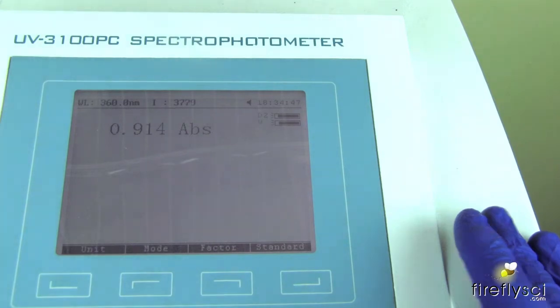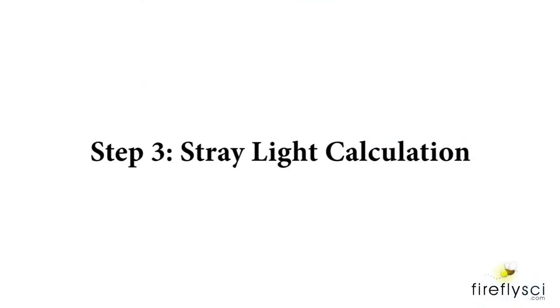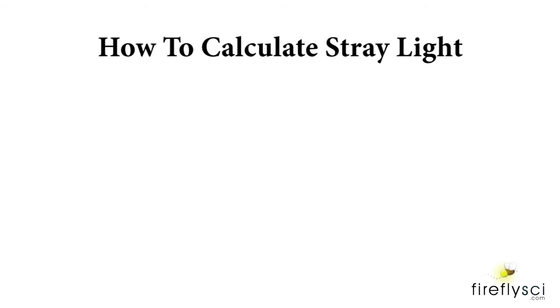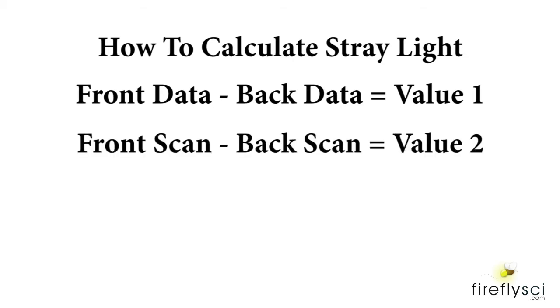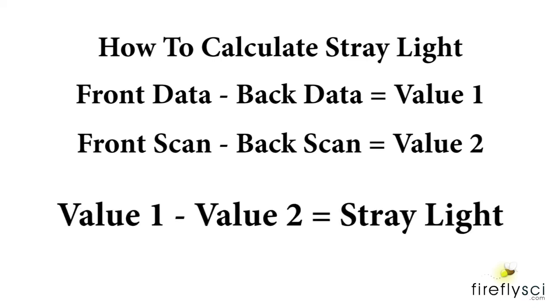And now let's go over how we calculate stray light with these two values. So we need two sets of values to calculate stray light. Value one is determined from the data on the certificate of calibration. So we take the front data and subtract it from the back data and this will give us the first value we need and we'll call it value one. Value two, we take the readings from the front and back scan that we just took. We have to subtract value one from value two and this will give us the stray light for our machine.